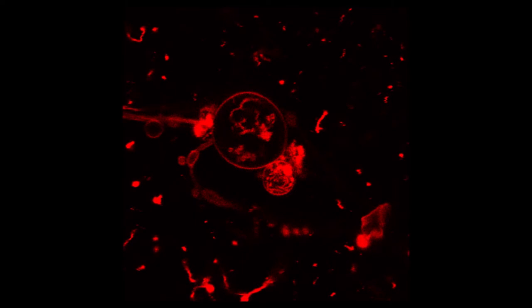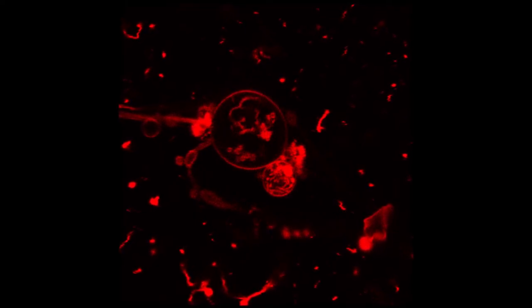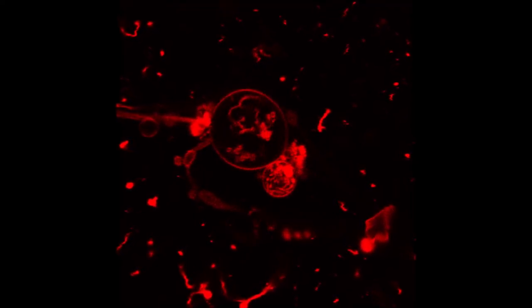It is an artificially prepared liposome created from egg PC. This vesicle was created from dioleoyl phosphatidylcholine.